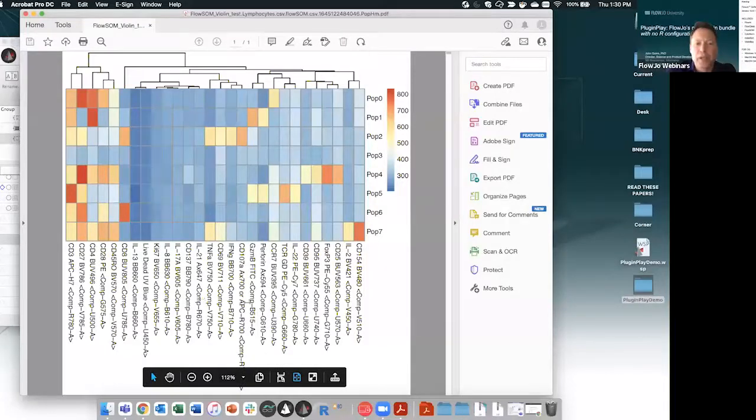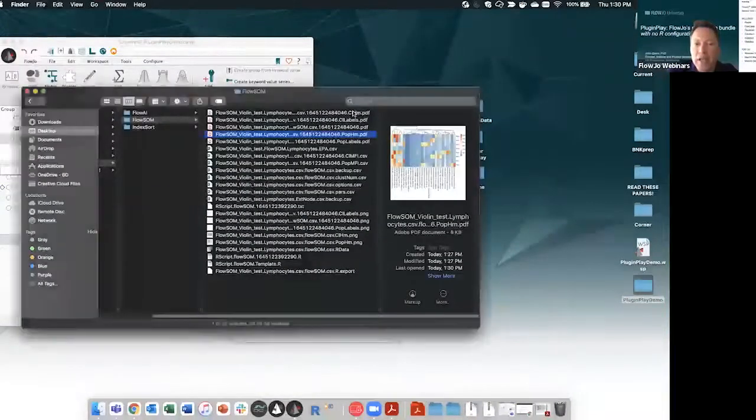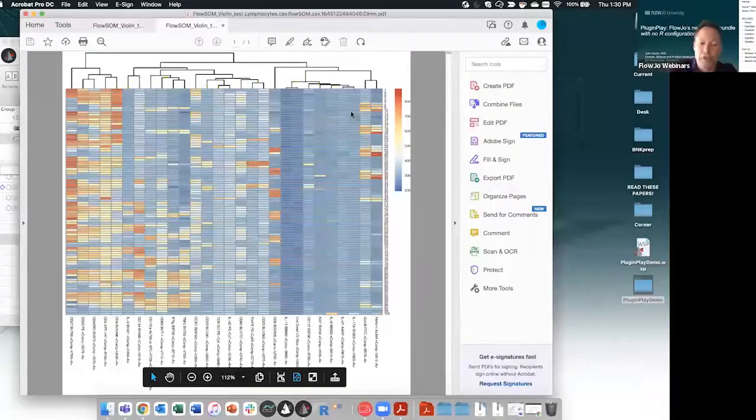So we can go through and say, okay, great. So there's population 1 and 2, orange versus blue, for whatever APCH7 there at the start. And move, oh, sorry, CD3 was probably the more relevant bit. So here's my CD3 positives. I gated some lymphocytes. Here's the one big negative population where we tossed all our negative for everything, and we can see which markers are most closely aligned. If we use the cluster version of that heat map, it's going to show us the same thing, but for the 100 nodes.